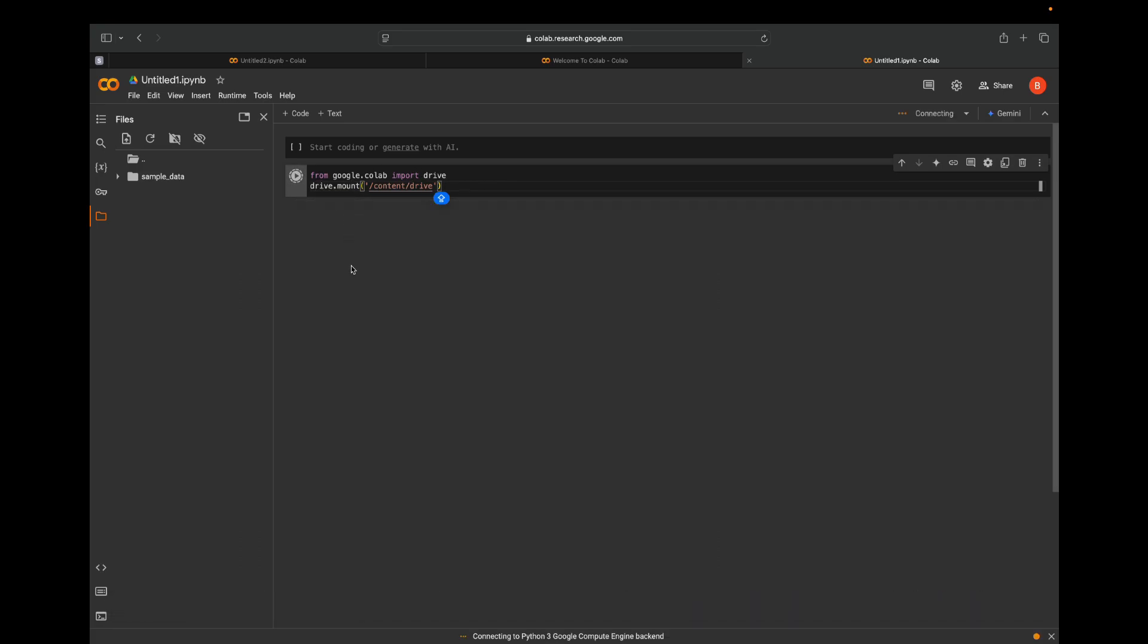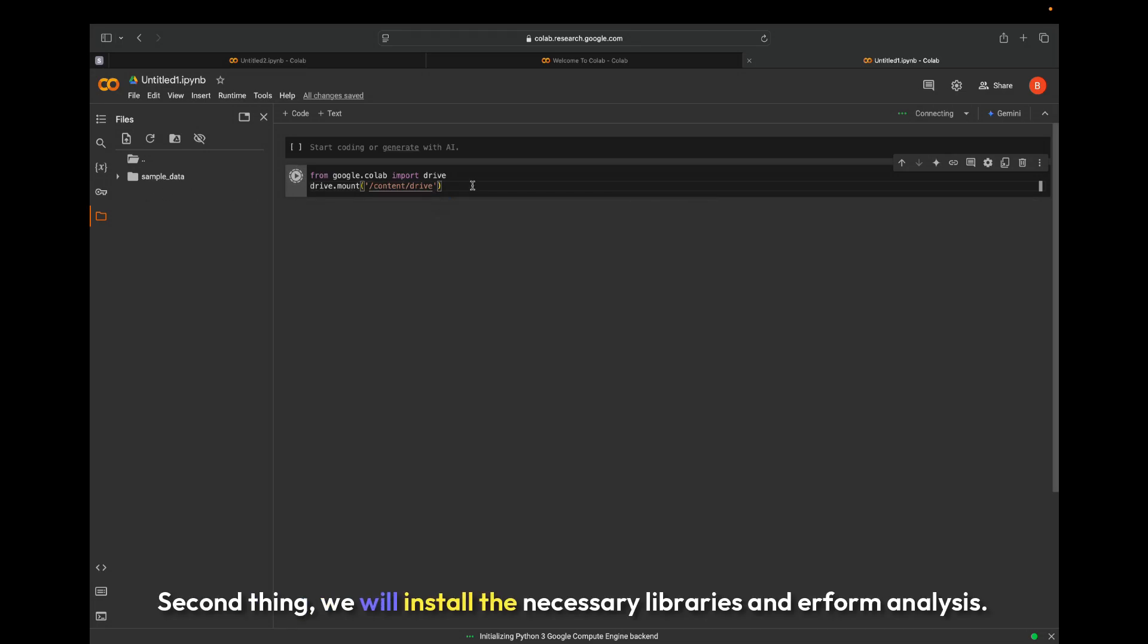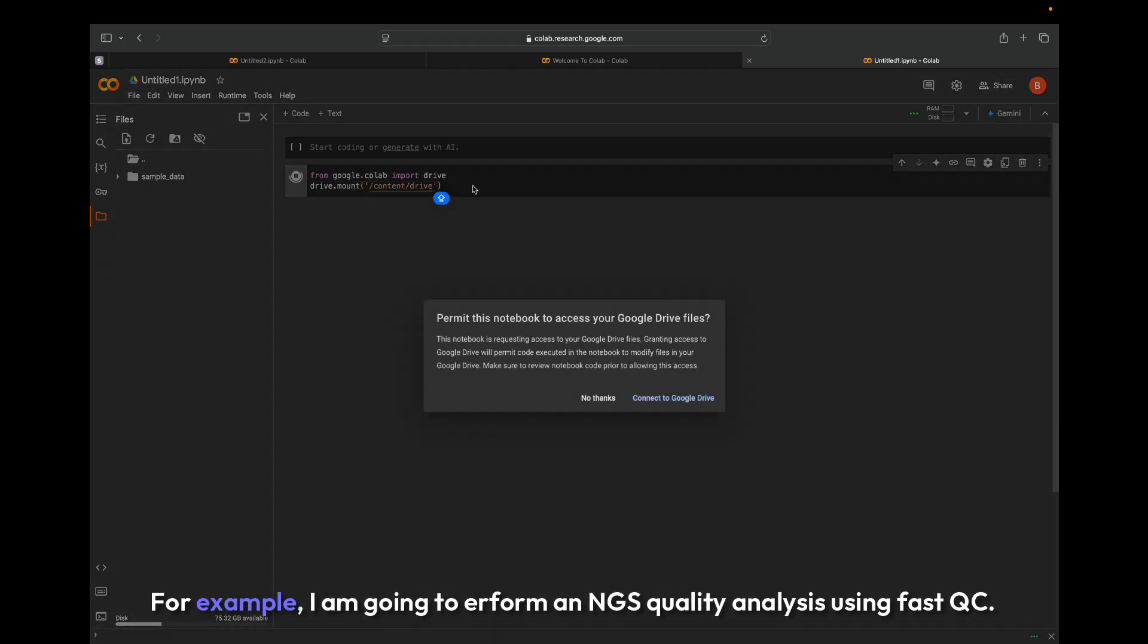Second thing, we will install the necessary libraries and perform analysis. For example, I am going to perform an NGS quality analysis using FastQC.